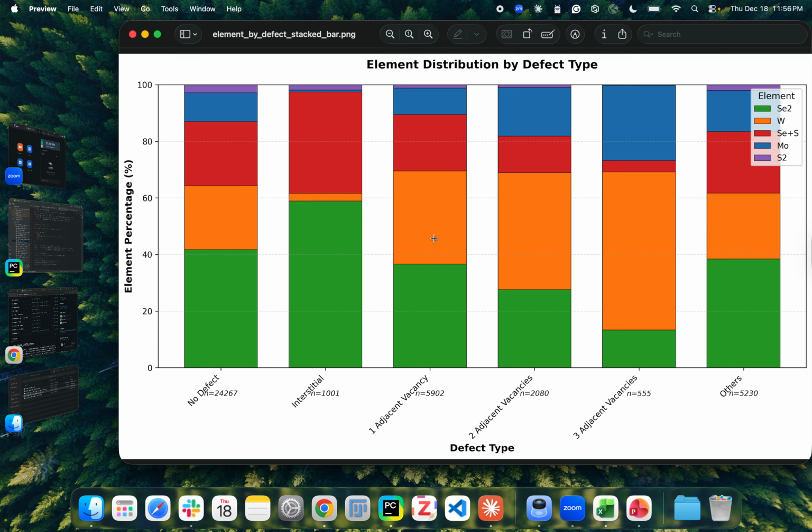The idea is that this kind of data set can be used to train machine learning algorithms in future. Because we had only 19 images, we went for a non-machine learning approach, but we are pretty confident in the data that we are producing here, that if we have thousands of images we could very easily generate ground truth data that is very close to the real ground truth. But of course it's not 100% accurate, but it does a pretty good job.